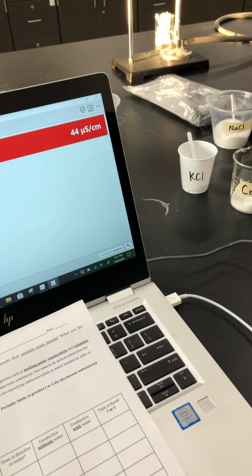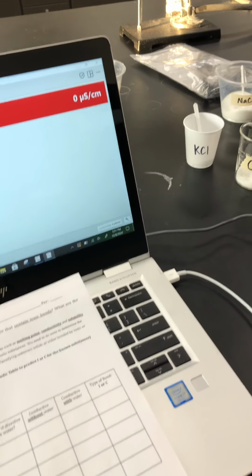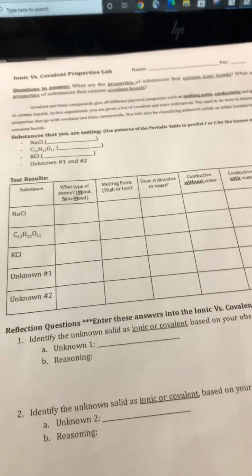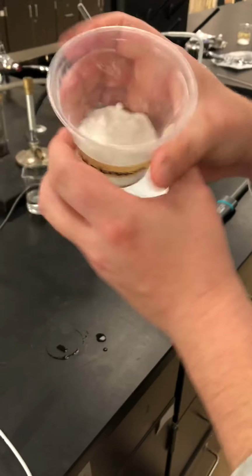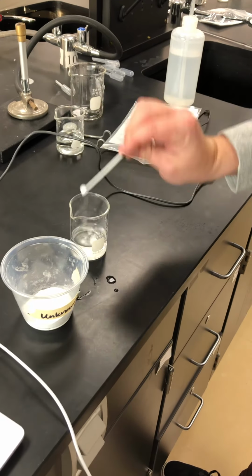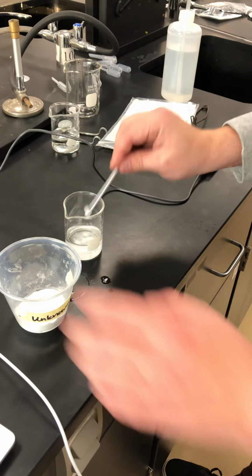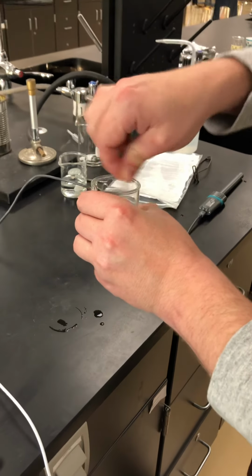Now we're getting ready to test the two unknowns. The unknowns are number 1 and 2. Unknown 1 is a white solid as well. And we're going to scoop 4 scoops into it. Give this one a stir.